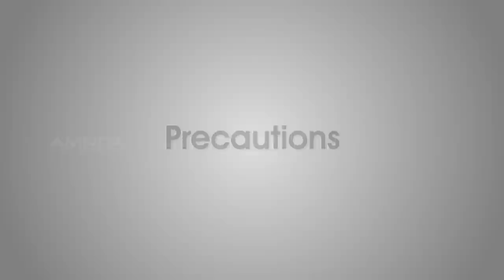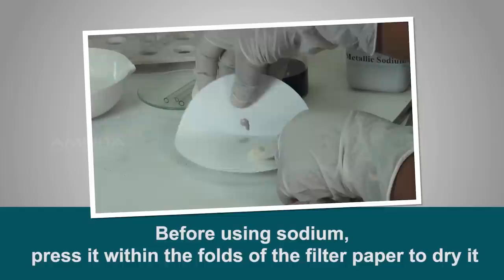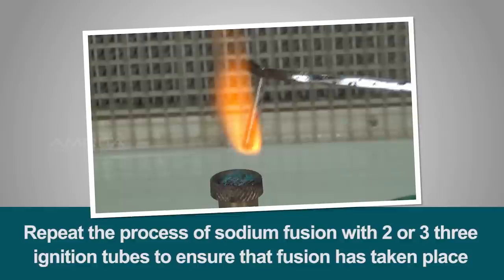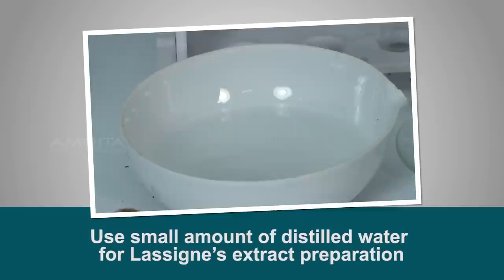Precautions: Always use forceps while handling sodium metal because it is highly reactive. Before using sodium, press it within the folds of the filter paper to dry it. Use a dry fusion tube for sodium fusion. Repeat the process of sodium fusion with two or three ignition tubes to ensure that fusion has taken place. Use a small amount of distilled water for Lasagne's extract preparation.